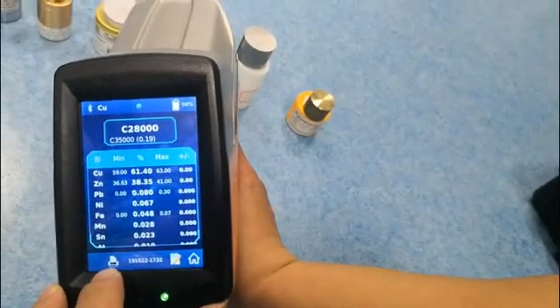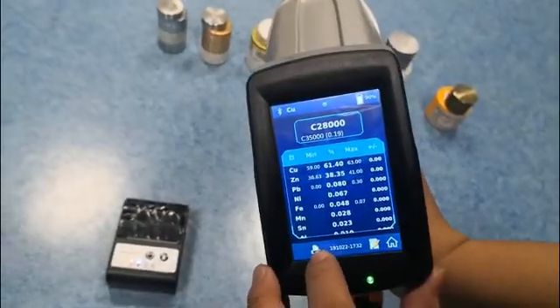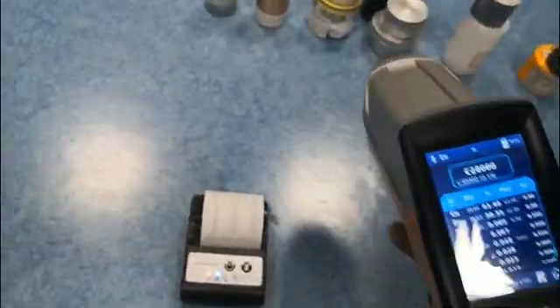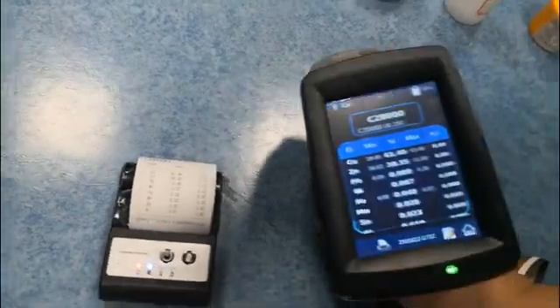Now we will show you how to use the printer. I move to print — you can see print here. I click okay and the printer will print out the result.